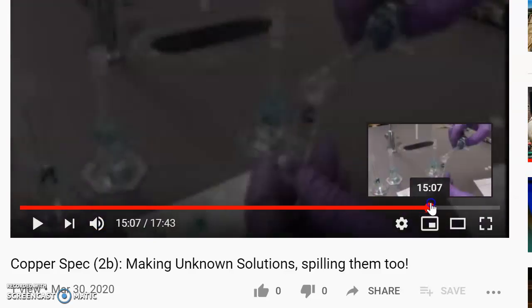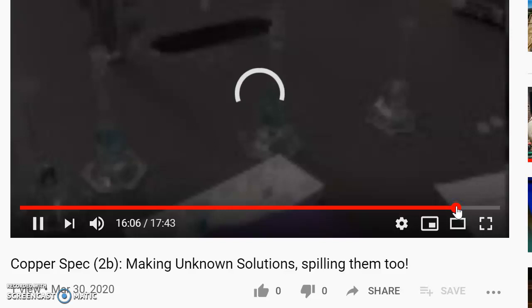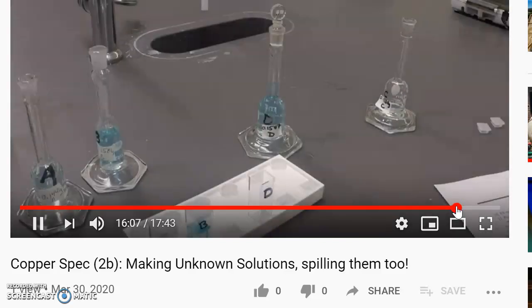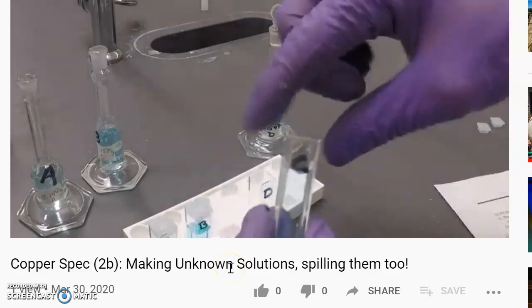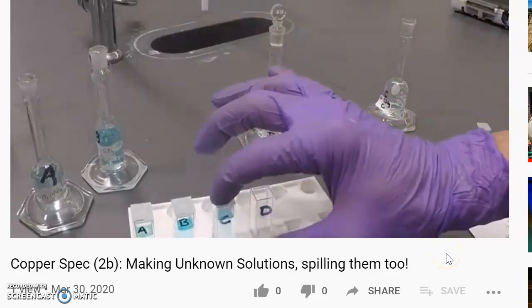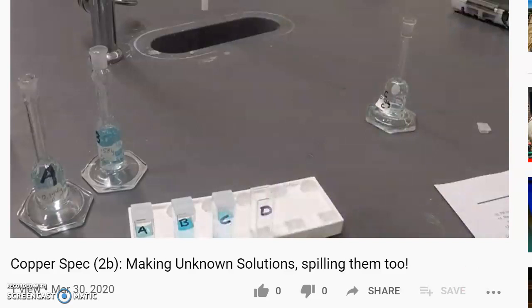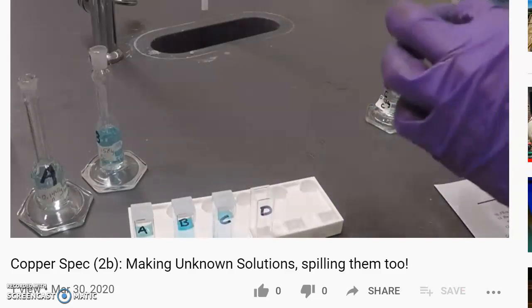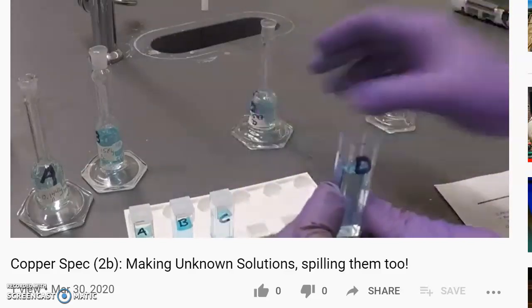I know I showed you before with the samples, but it's kind of nice to see. So we have C, recapping. And D.